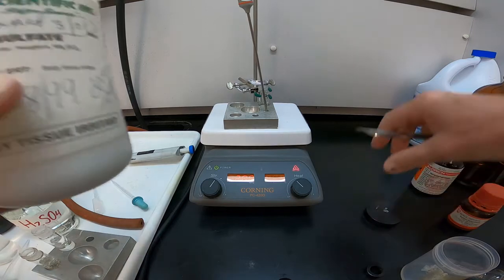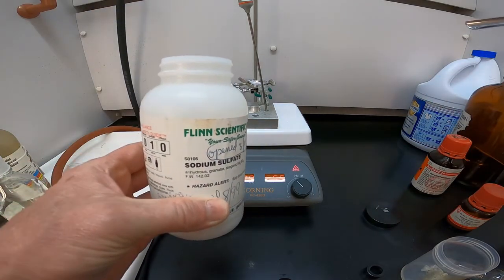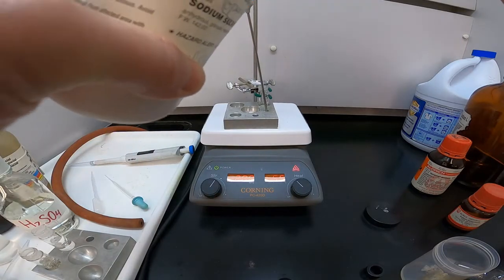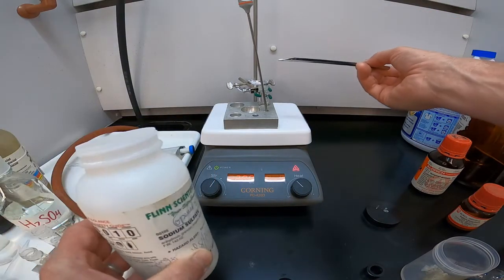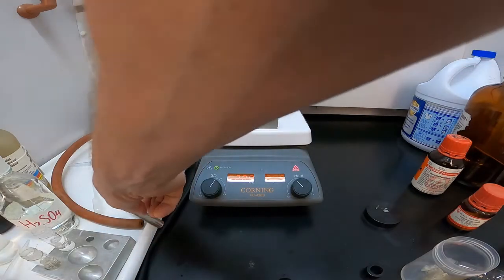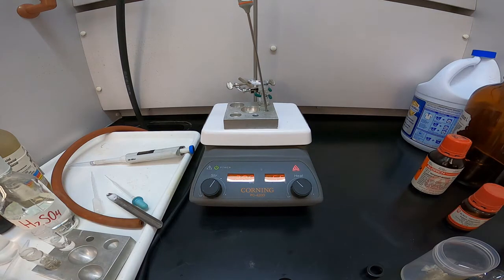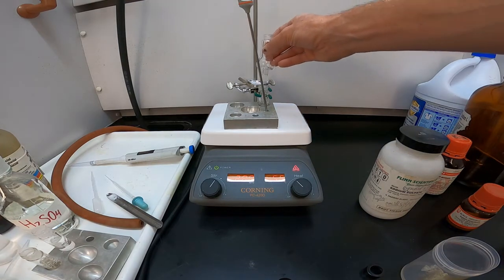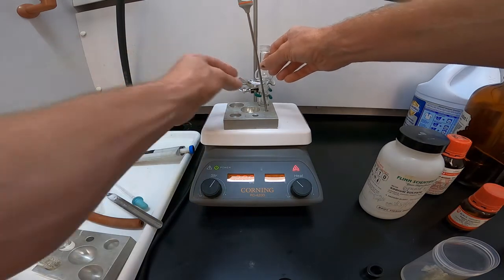But the water part would not have easily dried away. So what we do to absorb any excess water before we start the distillation is add a little bit of what's called a drying agent, in this case sodium sulfate. The sodium sulfate drying agent just absorbs any last bit of moisture that was present from doing the organic extraction with the sodium bicarbonate. So I try my best to leave behind all the aqueous layers and only get the organic layers, but there's always going to be a tiny amount of water that carries over. What we do now, I can set it up with the distillation head.